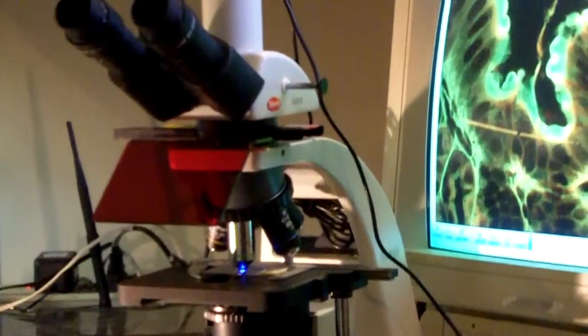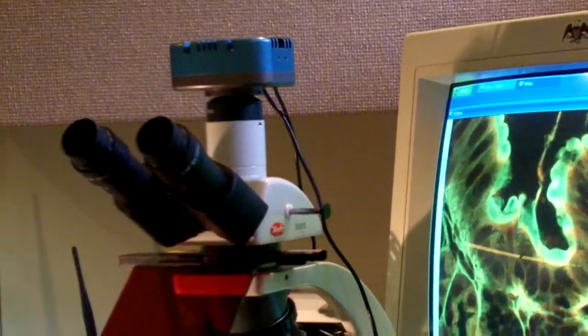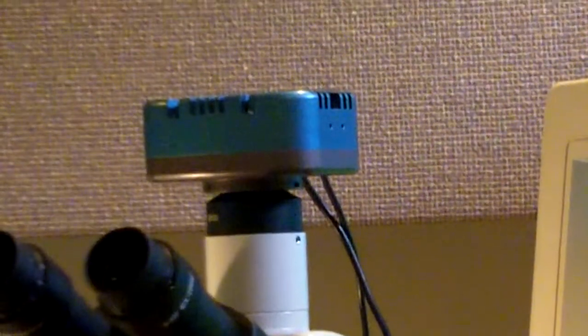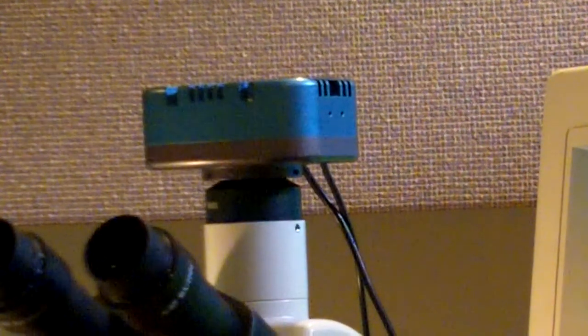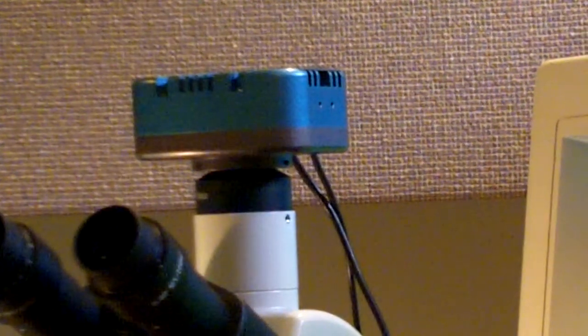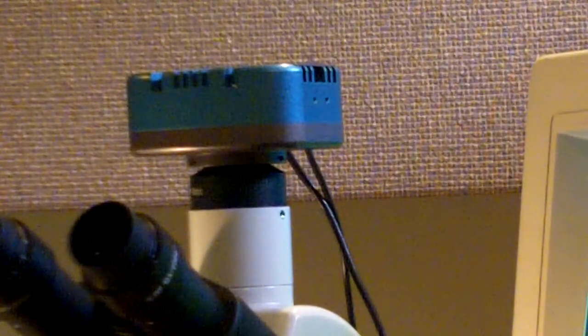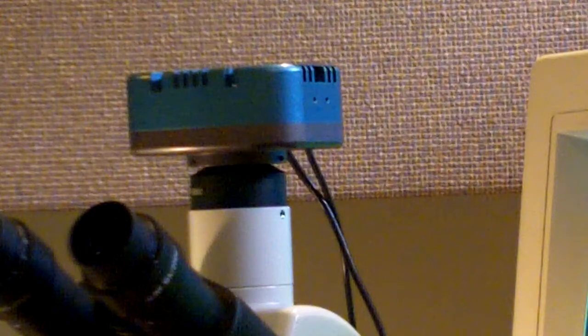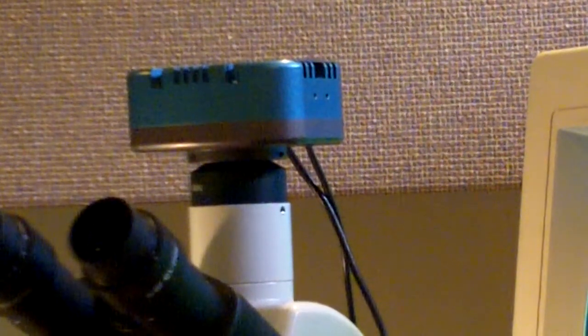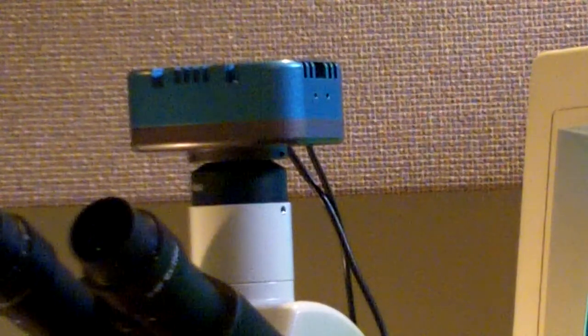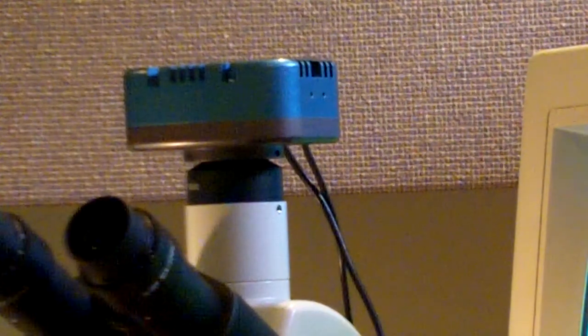The recording system that you see up top is a Peltier cooled digital camera that is USB connected to a Windows environment. This 3.3 megapixel version utilizes the latest Sony CCD, which puts out at 5 frames per second a 2048 by 1536 array, with each pixel being 3.5 microns.